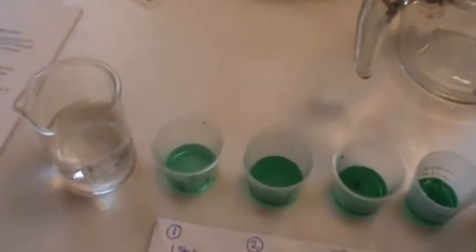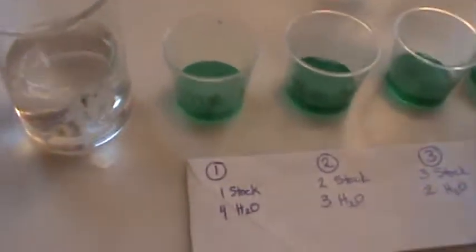All right, and so now what I'm going to do though is I'm going to fill this, hopefully without making a mess, with my solutions. Okay, and there is solution number 1, which we are calling 2 molar.